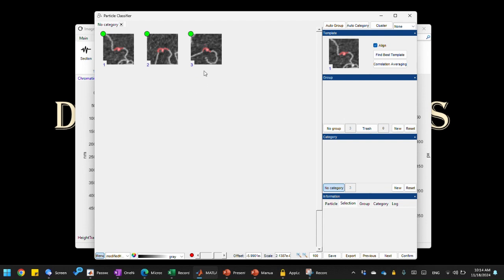And one limitation in this approach is that you cannot see the particle parameters, or rather the region parameters, in the informational panel. It does not work because the regions include not just one particle, but all the masked features inside that region.